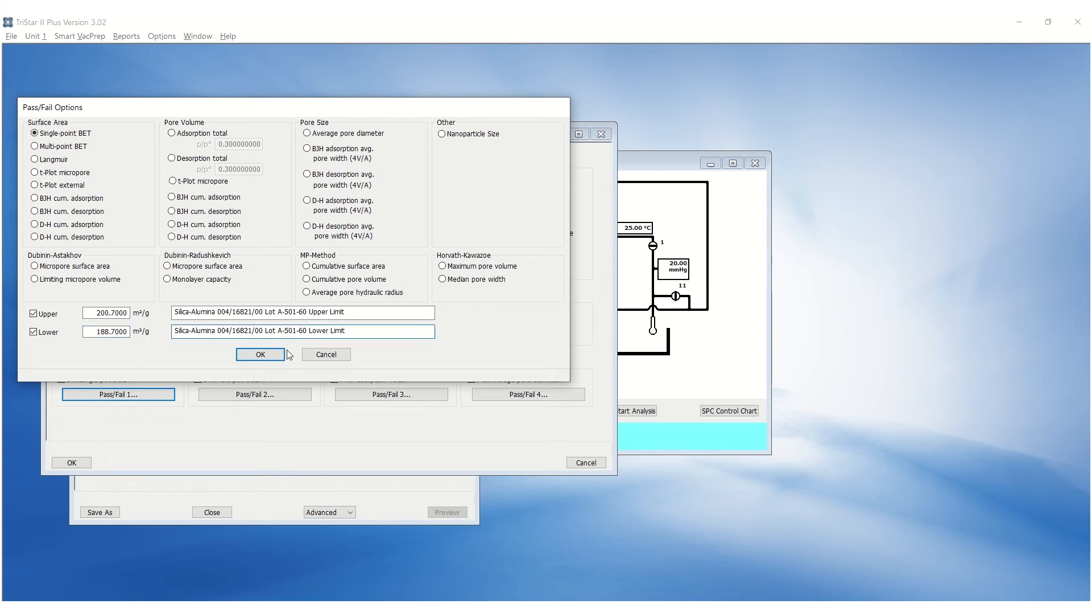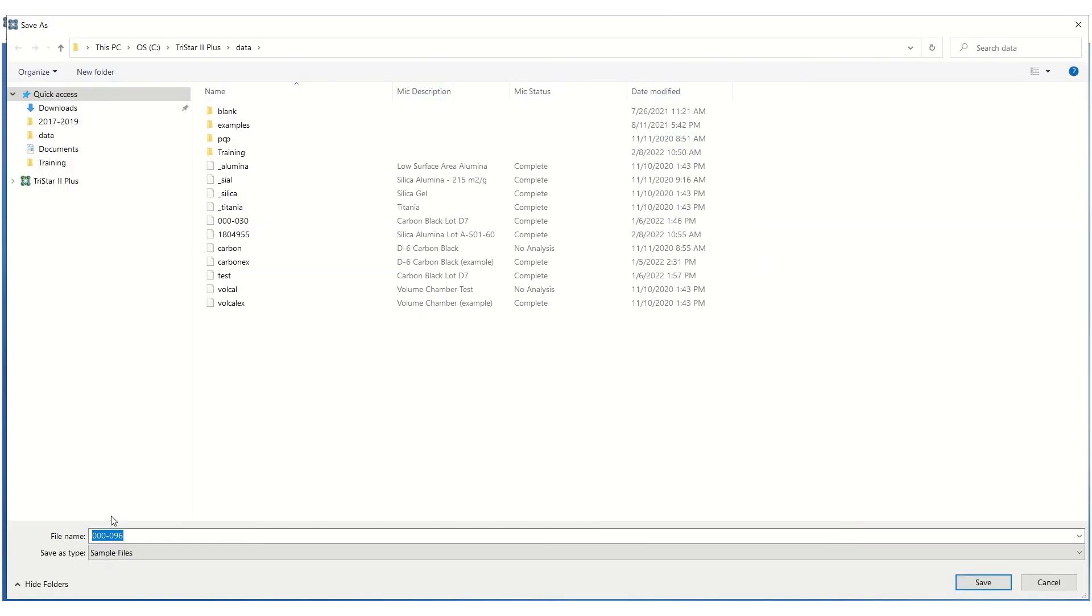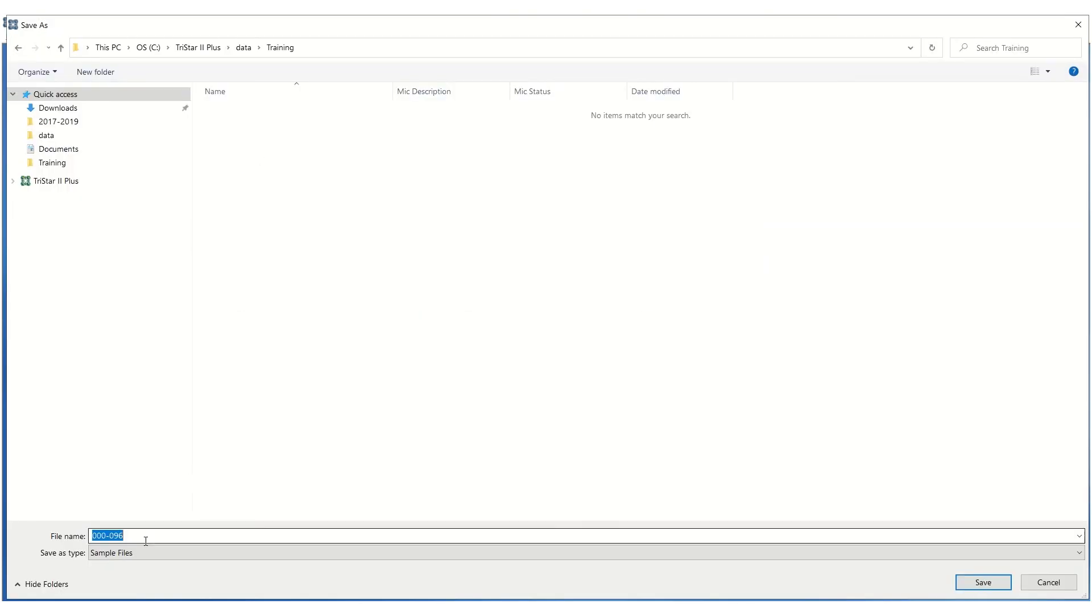Click OK to save. Repeat this for all pass-fail reports. Click OK when finished. Click Save As, enter the desired name and save.